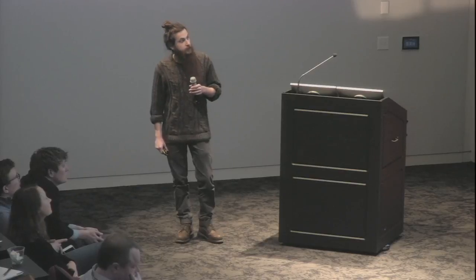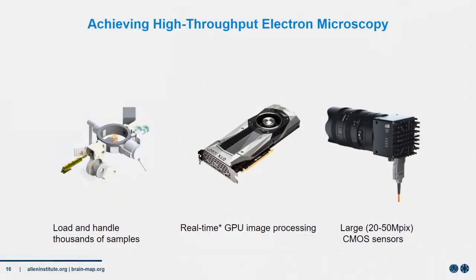And then finally, we also have to maintain the health of the environment of the microscope by monitoring the temperature, environmental conditions, as well as internal states of the machine to maximize uptime. And so here are just a few examples. There are many, many other things we've done, but here are a few highlight examples of things we've added to our transmission electron microscope that you saw in the video that was previously shown.